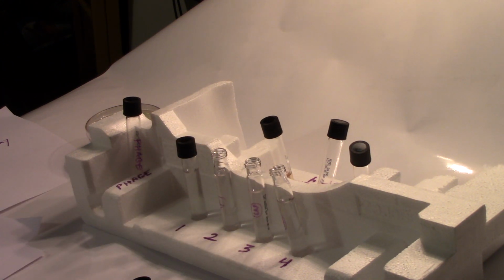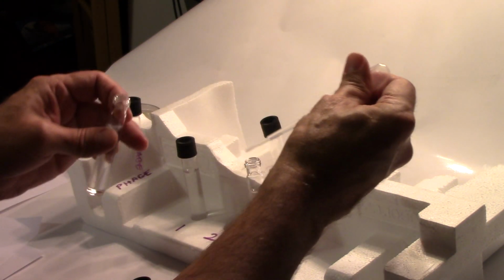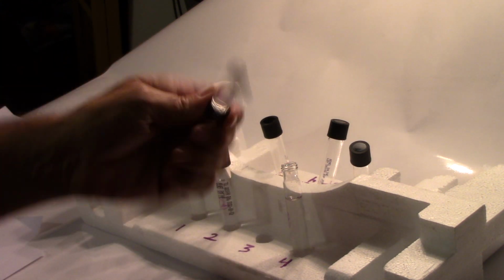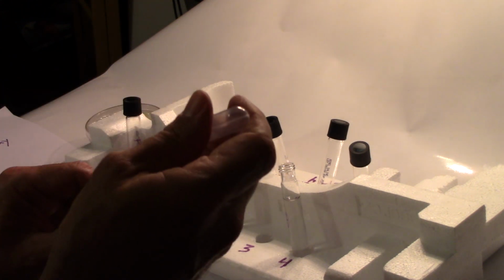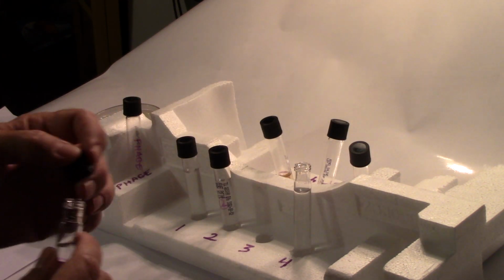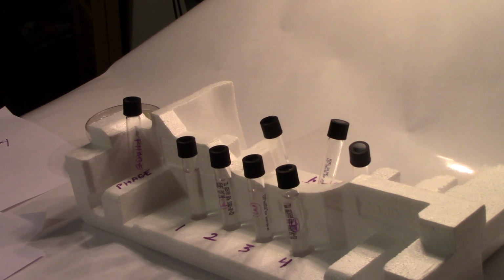Continue with my serial dilution. Add 1 part to my next 9 mLs. Get rid of my pipette. Mix that. Fresh pipette. Add 1 part, 1 ml to my 9 mLs, my 4th tube. Mix it. And now I have my serial dilution of my phage.